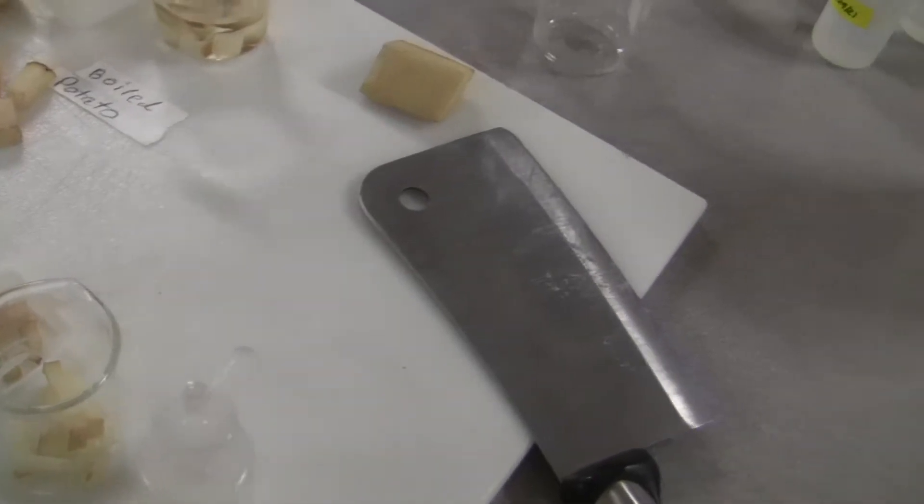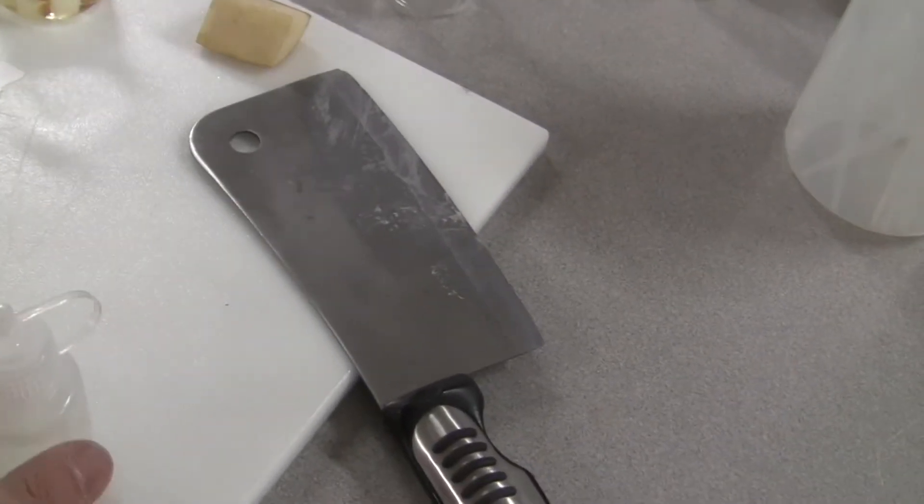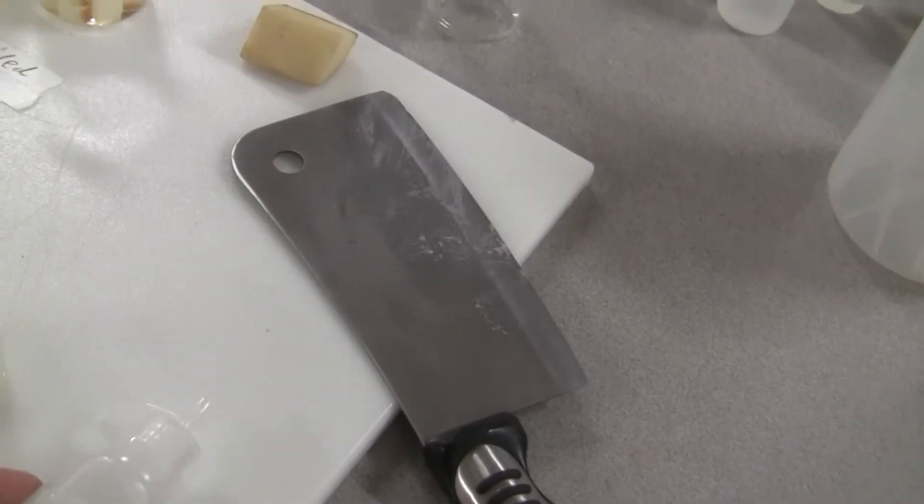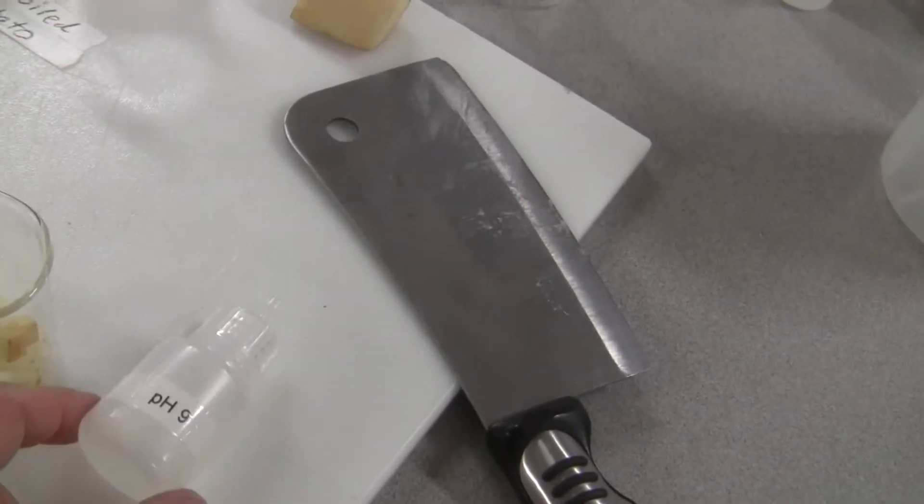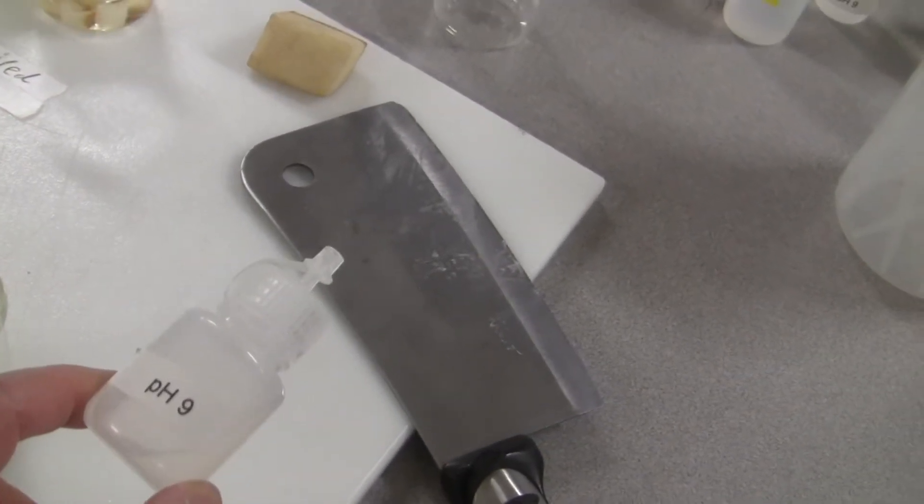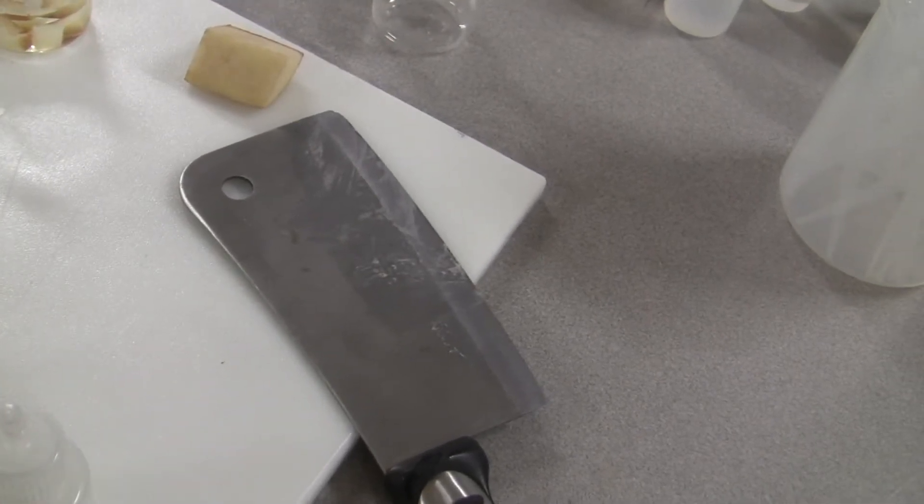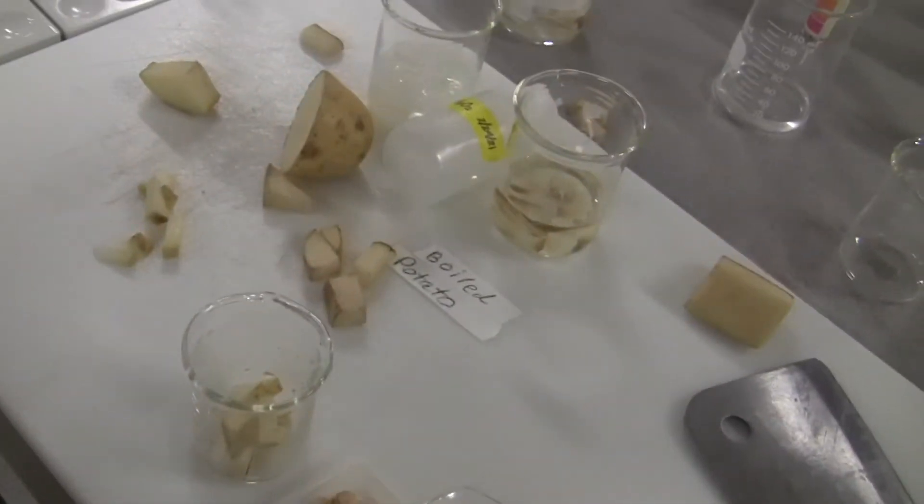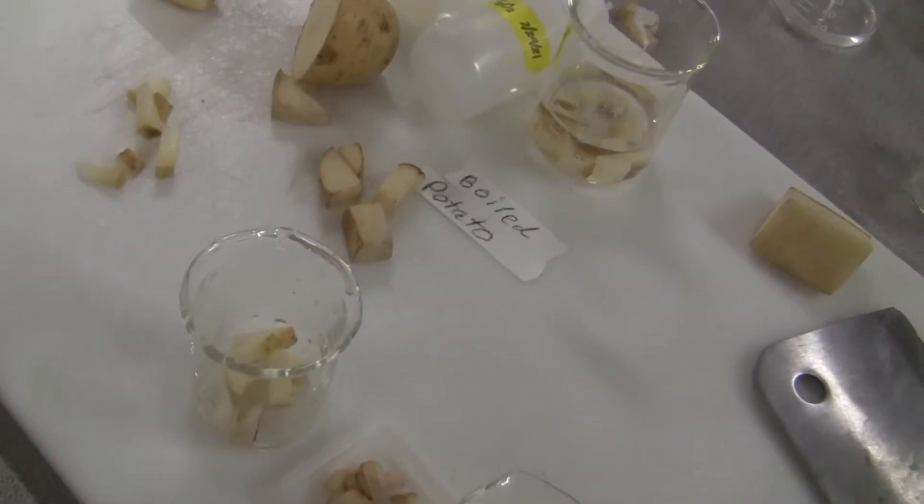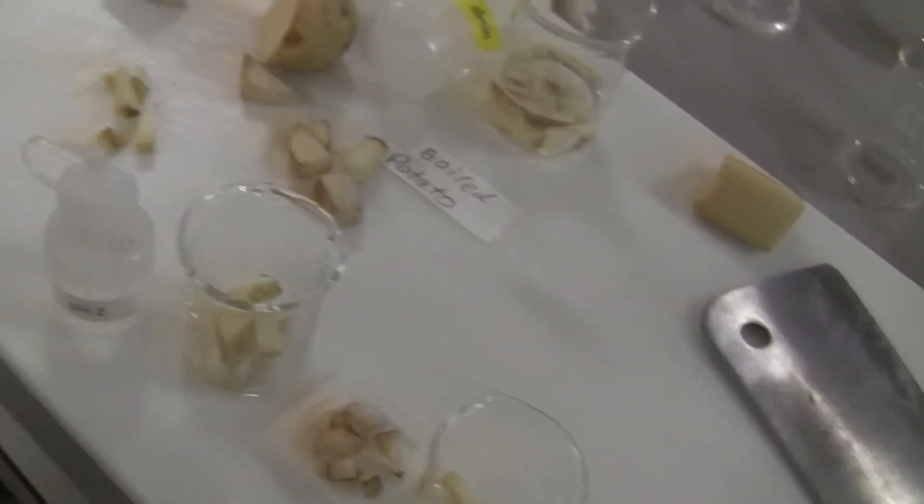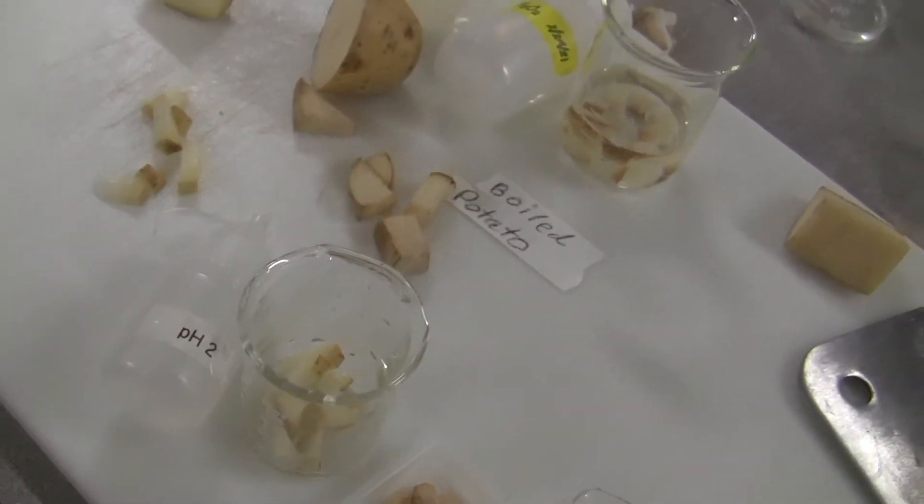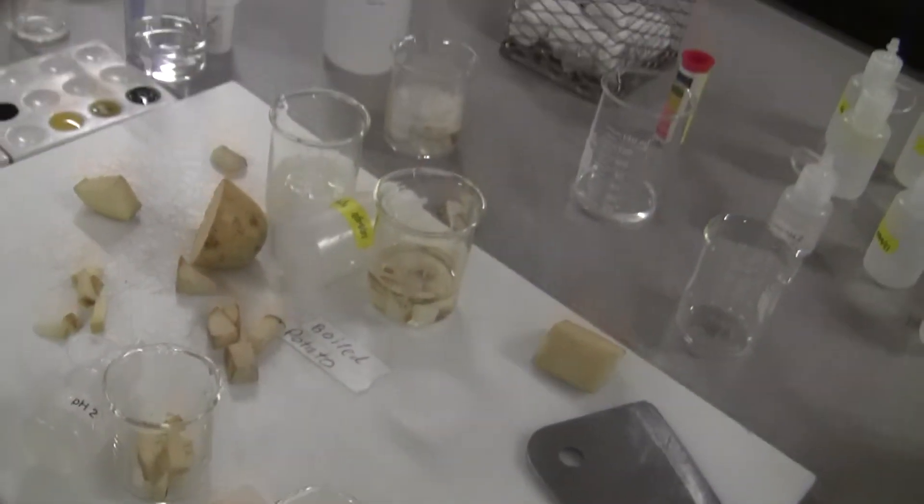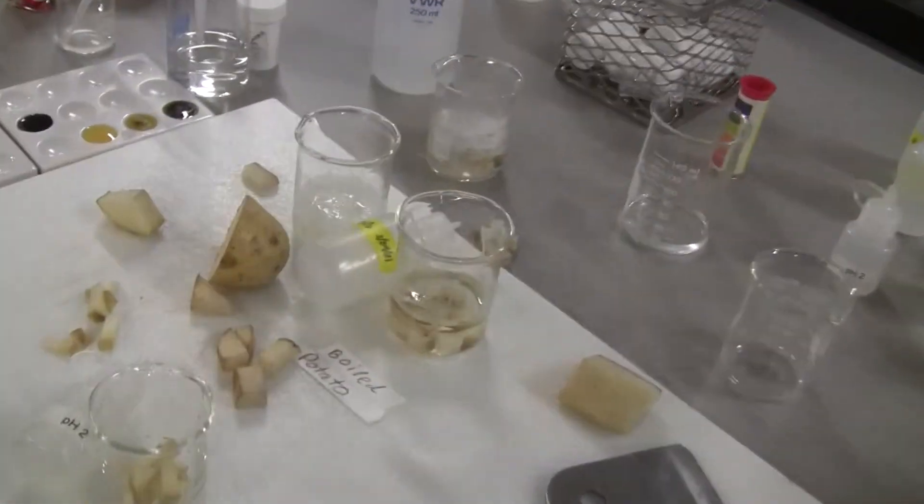Let's start with the pH first. Some pH 9 right here, if you guys can see it. The solution is a very basic pH of 9. And then this one has pH of 2 right there. Maybe I should not move them around so much so you can see it. pH of 2. So I'm going to pour some of these into the beaker. I hope you guys can see.